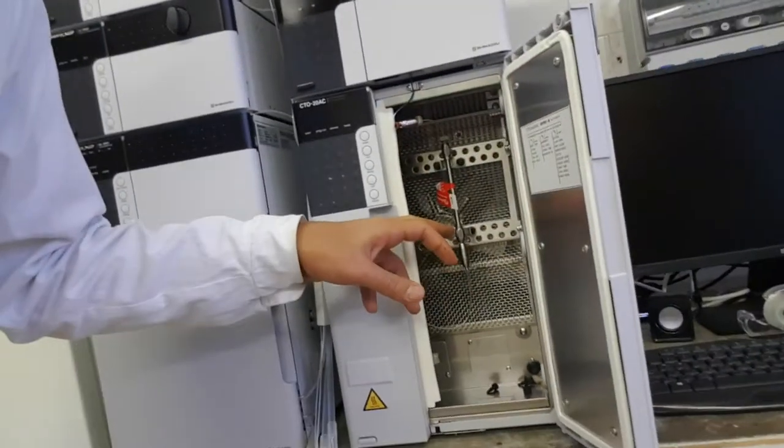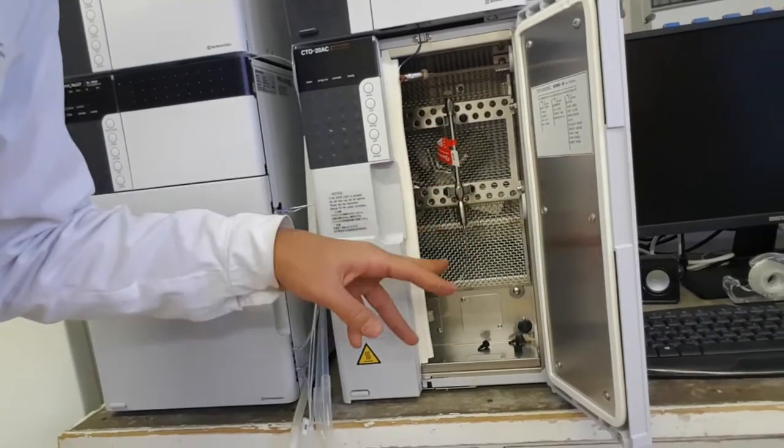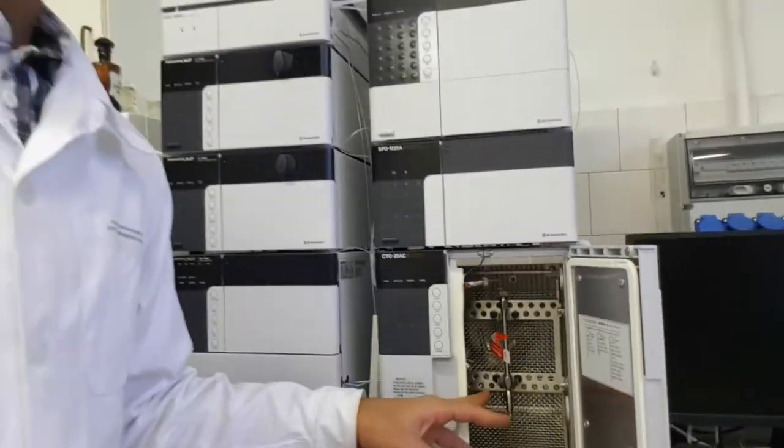I also forgot to mention that we have a variety of columns you can use. The characteristics and features of those columns are very specific and really expensive, so you need to order them in advance. It depends on what you are analyzing — if you have complex constituents in your sample, you will need to try a lot of columns in order to eventually find the right one that is suitable and most convenient for your experiment.